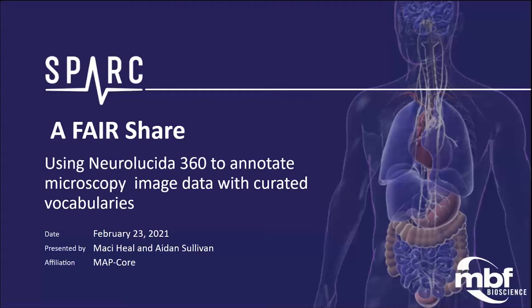Hi, everyone. We're here today to share with you how you can use Neurolucida 360 to annotate your microscopy image data with FAIR, curated vocabularies.